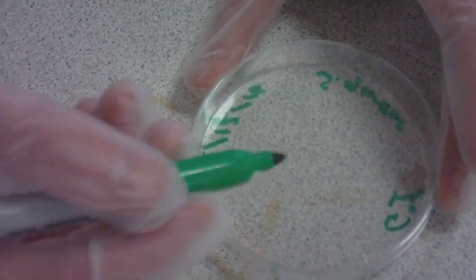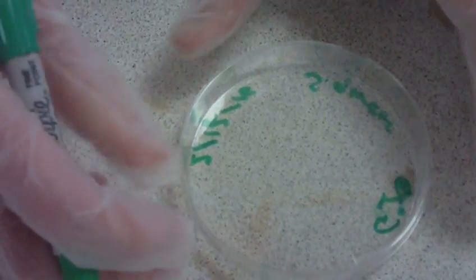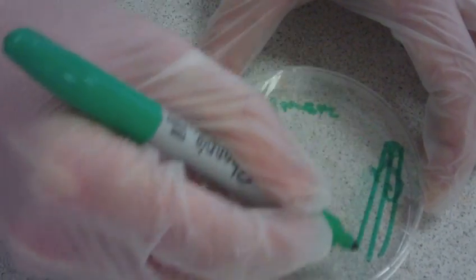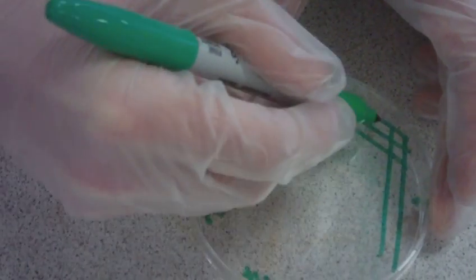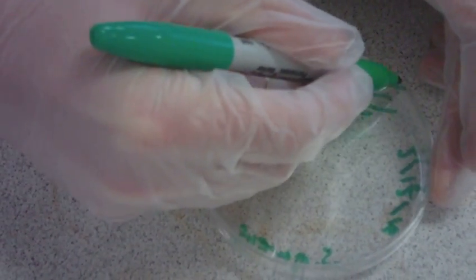Firstly, circle at 12 o'clock and do 3 to 4 streaks clockwise towards 3 o'clock. Turn the plate, do another 3 to 4 streaks, turn again and then the following 3 to 4 streaks.